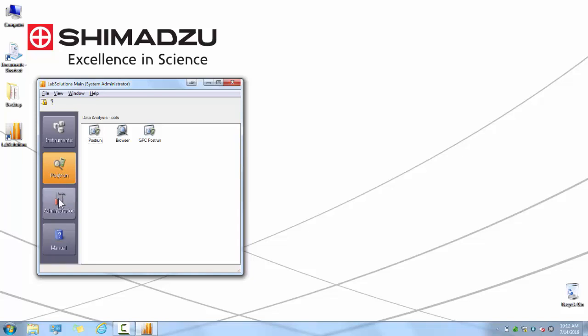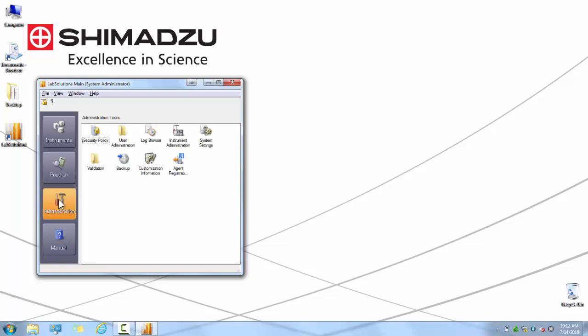The next tab is the Administration tab. Once you have clicked on this tab, you will be able to see all the available administrative features that are available in the software. These include Security Policy, User Administration, Log Browser, Instrument Administration, System Settings, Validation, Backup, Customization Information, and Agent Registration Settings.